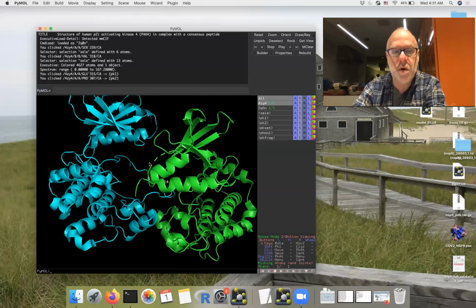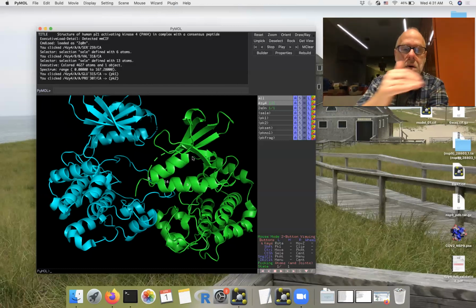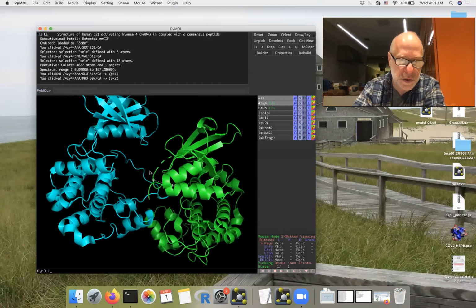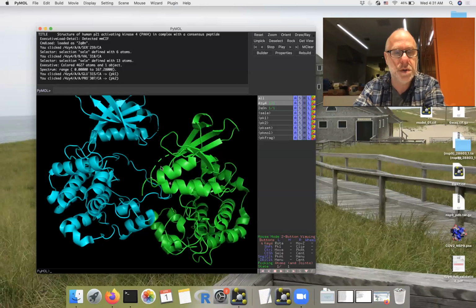And what that means is there are residues that were not modeled by the authors. There's no coordinates for them. And so PyMol has kind of interpolated where that loop would go, given its length. And I think it really just sort of completes a curve that covers the space where the residues are missing and connects it to the rest of the structure where the residues are present.